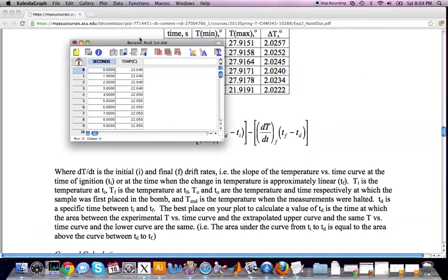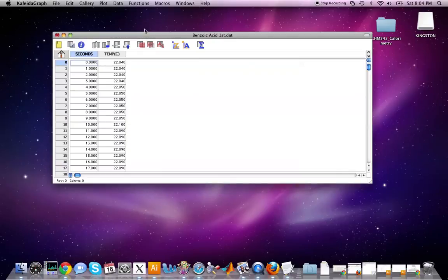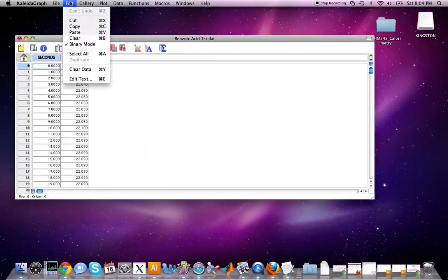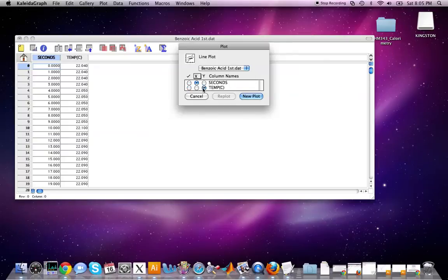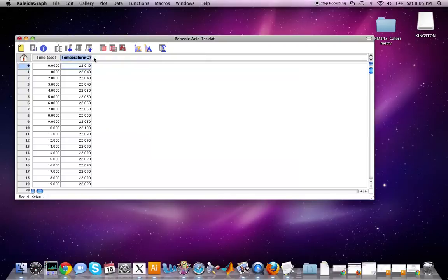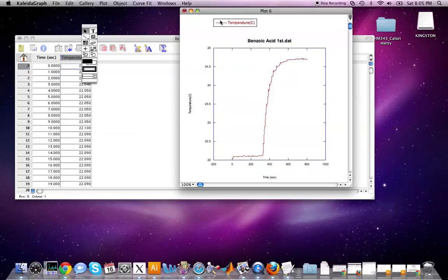You should have a data spreadsheet. Close the extra data window and widen the spreadsheet since we'll add more columns. The first thing to do is plot the data. Go to Gallery > Linear > Line to make a line plot. Rename the columns — time in seconds on the x-axis and temperature on the y-axis. Create the plot. You can format axes for your reports, such as making the x-axis start at zero.